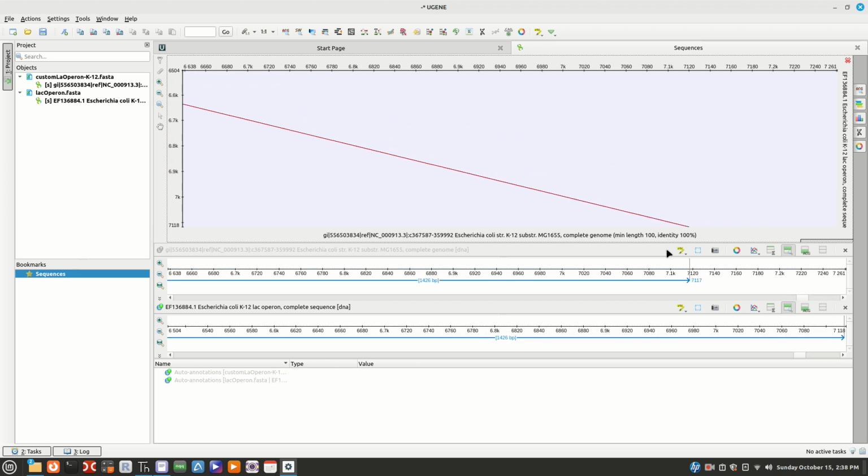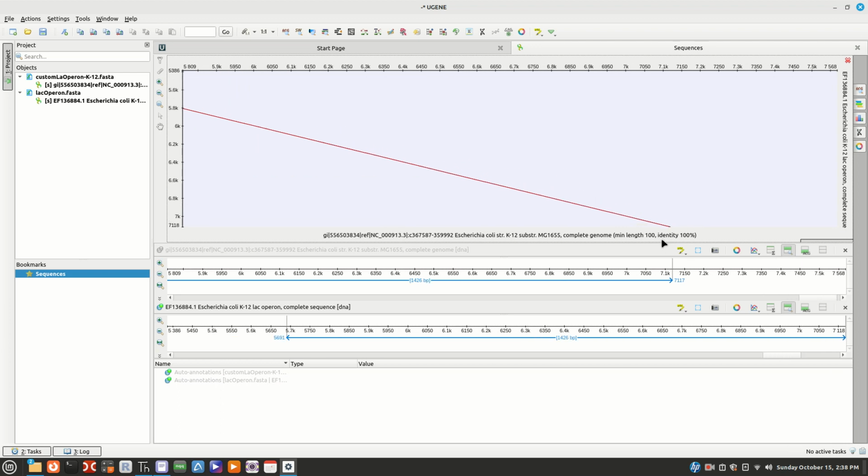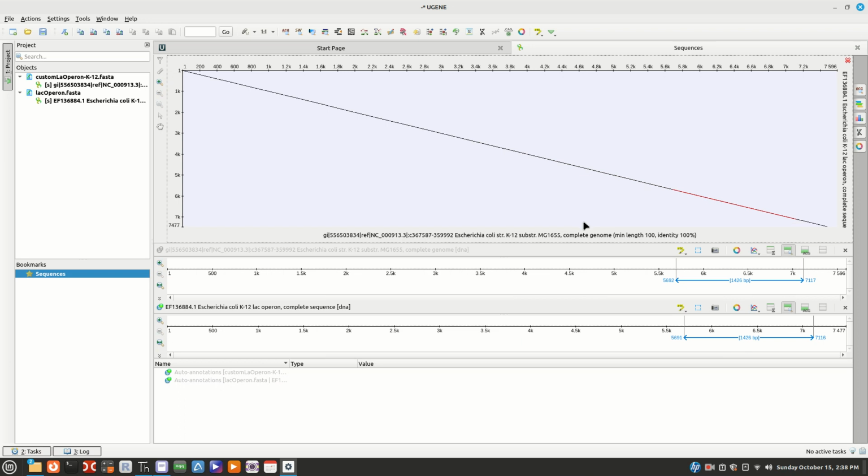Well, it means that my old one and the new one are not quite the same, and I would use the newer one, the one I found at the NCBI here, but I would go a little bit into the two outer genes, maybe grab all of them. That seems extreme, but you might go 100 or 200 base pairs.